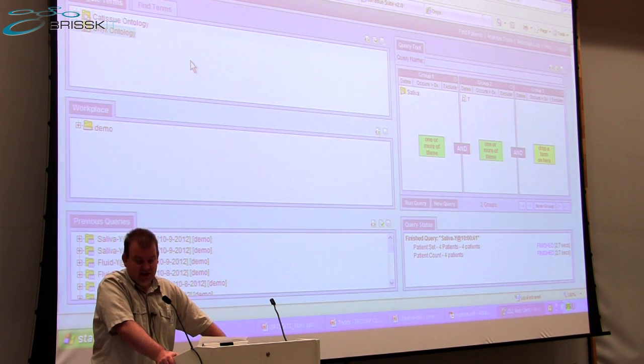In our BRU installation, we also have an ontology built from the hospital's pathology system, so we can cross-reference the data that's visible here with recent lab results, and we also have an ontology built based around data that we've derived through the hospital's data warehouse from a number of audit databases that have been populated over the last about 12 to 15 years in some cases, by colleagues in the clinical service in the cardiovascular directorate who have used a number of database systems to populate things like the MINAP and cardiac interventions databases.